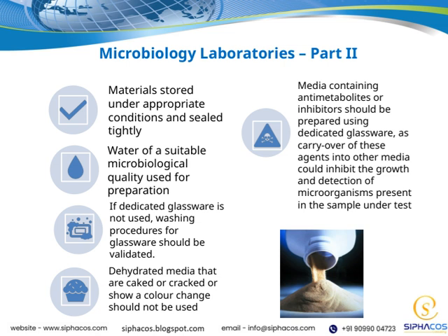We'll look at the different types of testing methods employed, such as culture techniques, staining procedures, and molecular diagnostics. These methods allow us to accurately detect and identify pathogens, which is crucial for effective patient care. Additionally, we'll discuss quality control measures that ensure the reliability and accuracy of laboratory results. Maintaining strict standards is essential because decisions based on lab results can significantly impact patient outcomes.